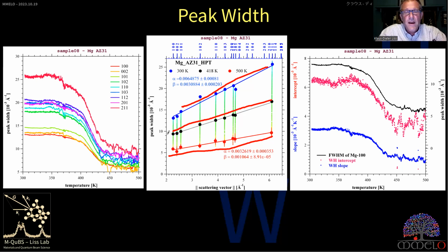They are supposed to be free of defects. Of course there are point defects, but they are supposed to be free of line defects and planar defects. So we have a good fit on a straight line during the recrystallization, and much later, after grain growth, we have the scatter again, and this is due to dislocations.